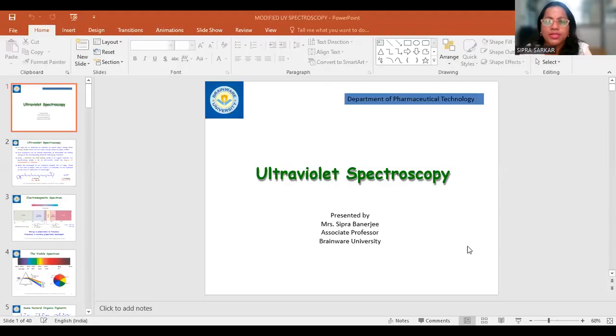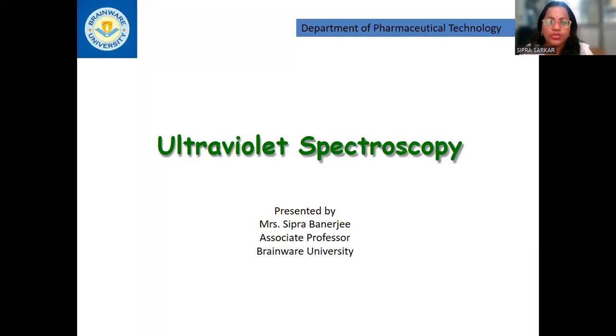Good afternoon, students. Today we will be discussing ultraviolet spectroscopy, UV visible spectroscopy. That is for the B Pharm 7th semester, and this UV visible spectroscopy may follow different categories also. So what is UV visible spectroscopy? This is a method of determining concentration and the bond length or the conjugation in the molecular structure.